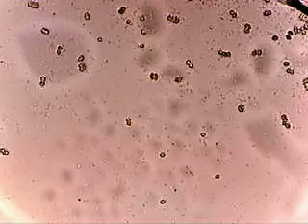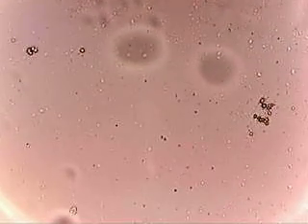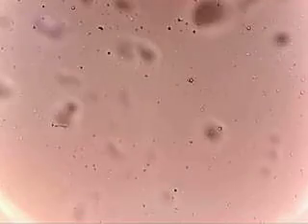Now, I could jump to conclusions and say, okay, well, this proves a symbiotic relationship and all that. It doesn't. Not by itself. It could just be an area of good nutrient, whatever, and both are thriving. Until you wander further out from the group and take a look at the ones far afield. Let's see here. I had them before. And you've got to see this because this is really interesting.